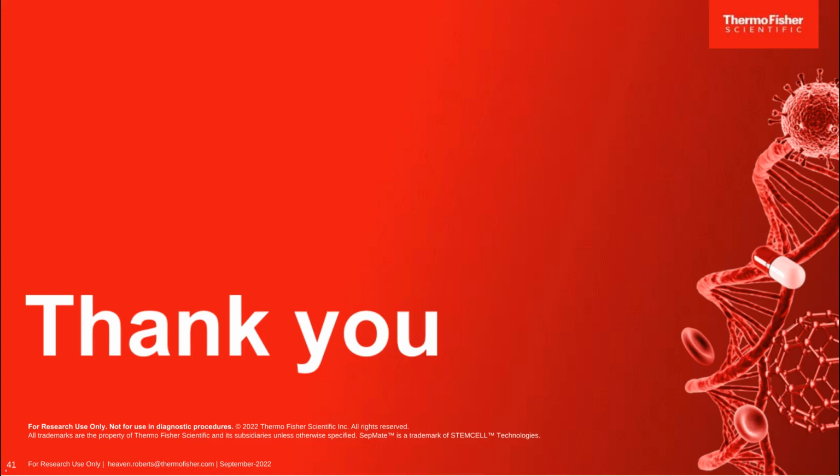Yeah, so at present, the software is actually scaling those images. So the images themselves are the same color. But think of it like scaling to the darkest event. So because the Dynabeads are so dark, because they absorb violet light, they're going to appear even darker on a lighter background. You can certainly adjust the intensity of the images in the software. You're not adjusting the image itself, just the display.